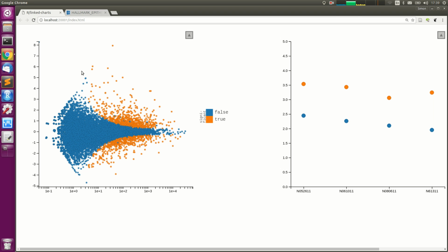With thousands of genes, it's quite likely that there are a couple of genes where we just arbitrarily have dozens of reads extra on one side and not on the other side. And what DESeq does is that it actually calculates this, and we'll see a moment later how it calculates that, and hence it accounts for this and makes this curved decision boundary.